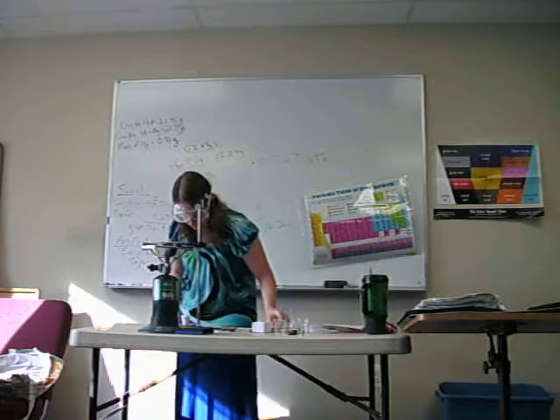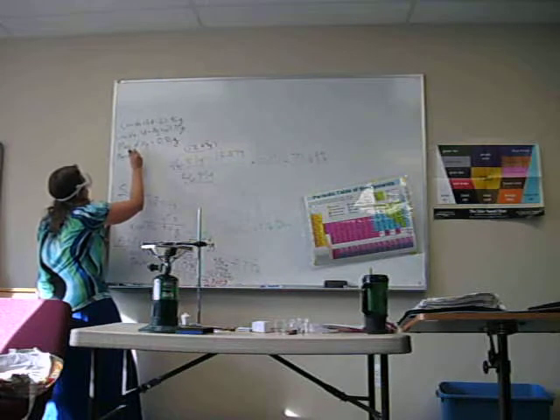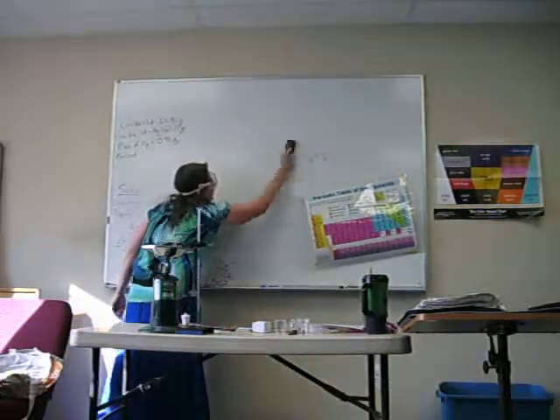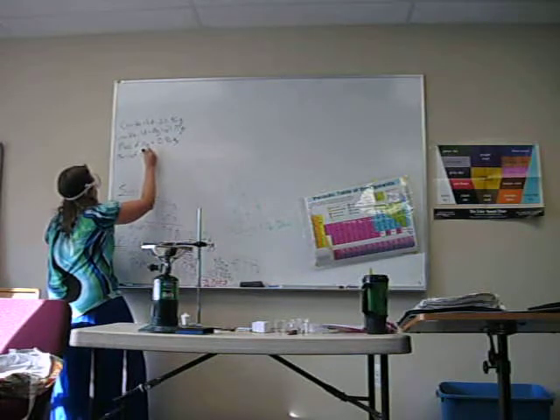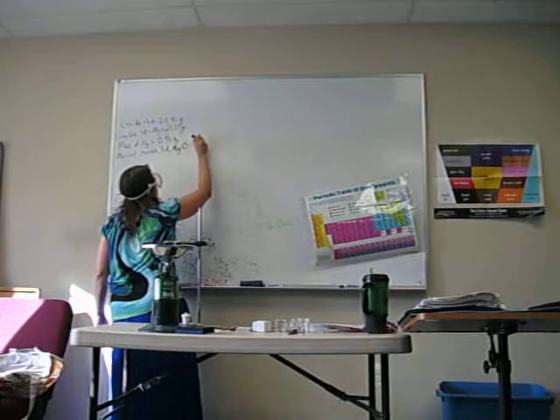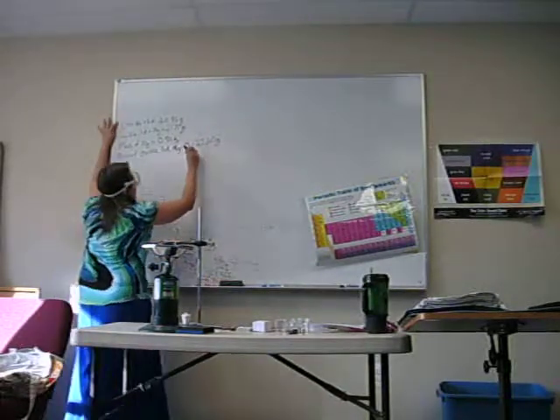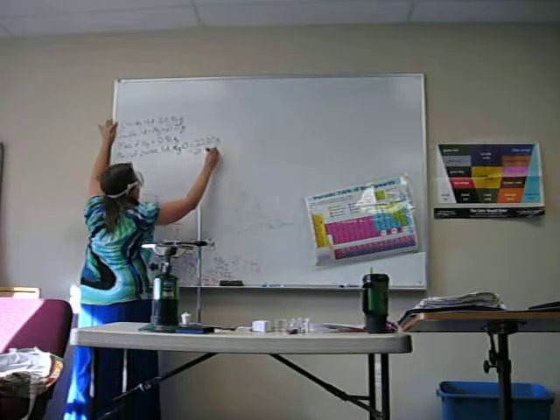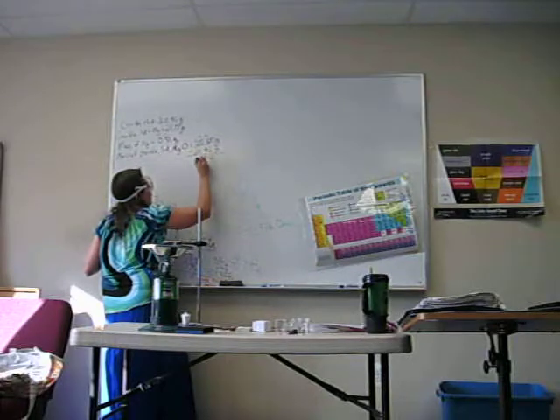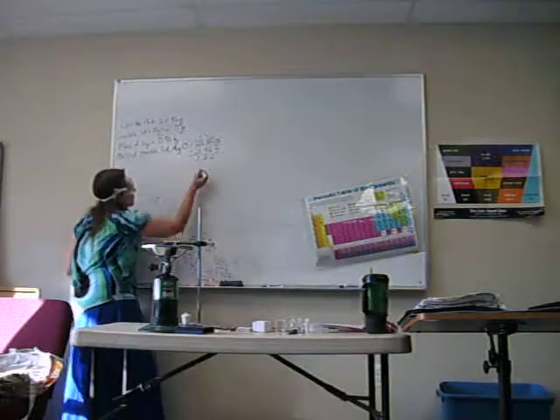Okay, so the mass is 22.2 grams. I might erase this. All right, MgO is a compound, 22 point. So if we subtract the mass of the crucible and the lid, then we can find just the mass of the magnesium oxide. Is that right? Would it be 1.24 grams?